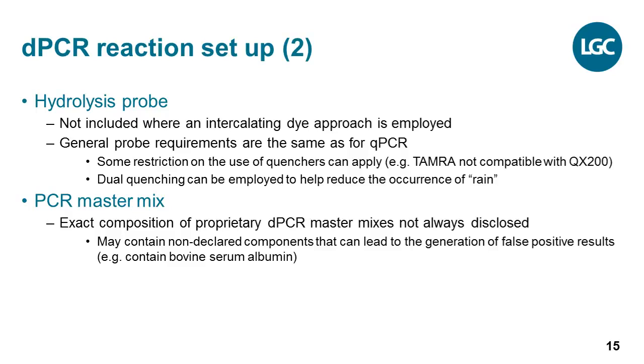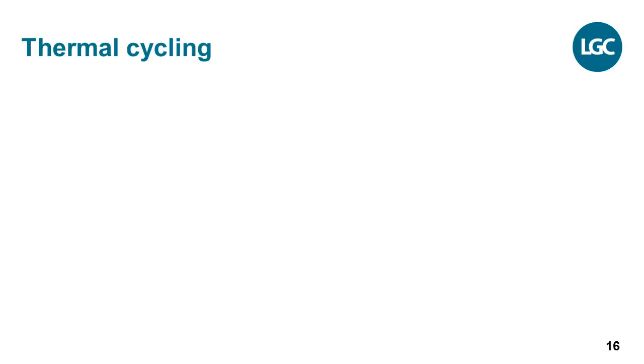The exact composition of proprietary digital PCR master mixes is not always disclosed, so an assay's performance should be evaluated through the use of certified reference materials where available. Finally, the reaction mixture should be adjusted to the appropriate volume with the addition of nuclease-free sterile water.